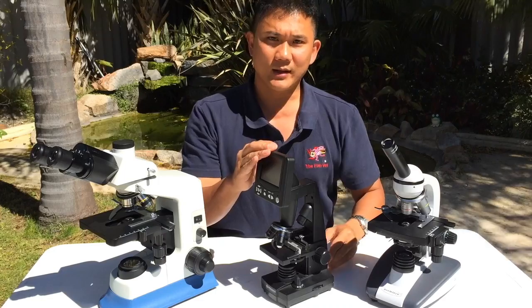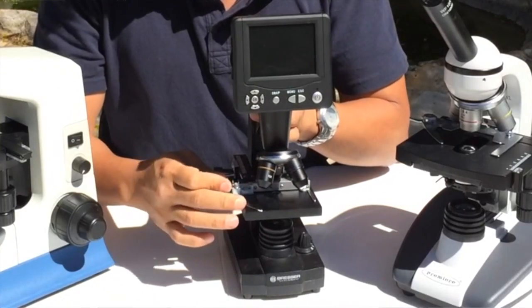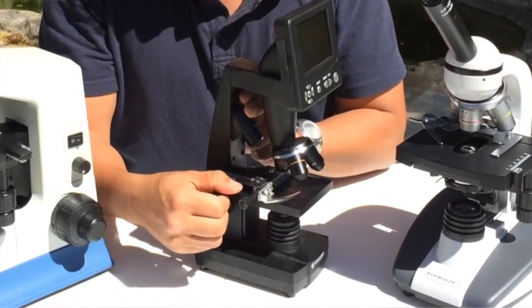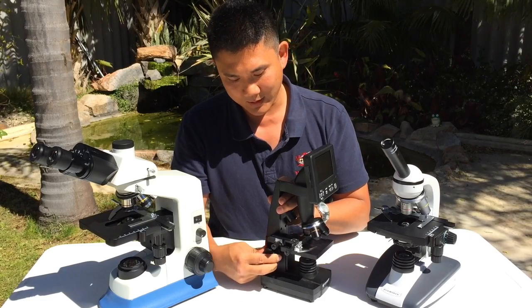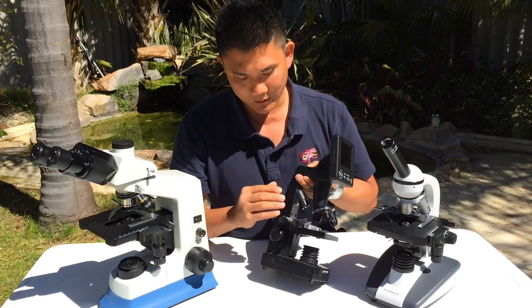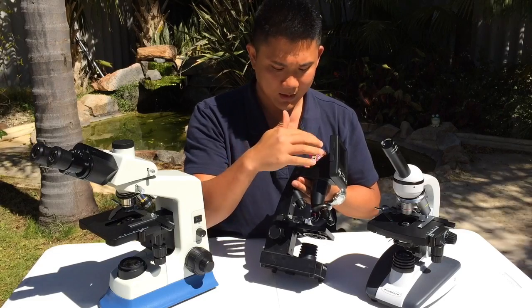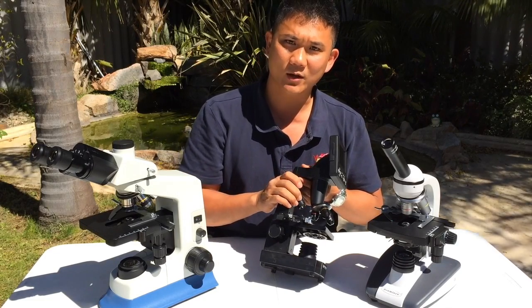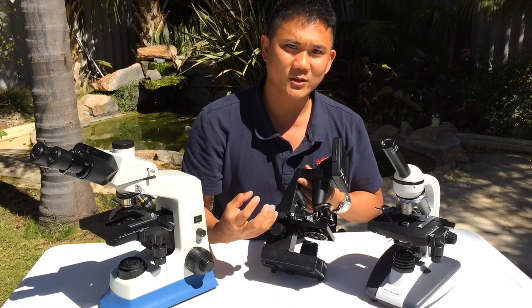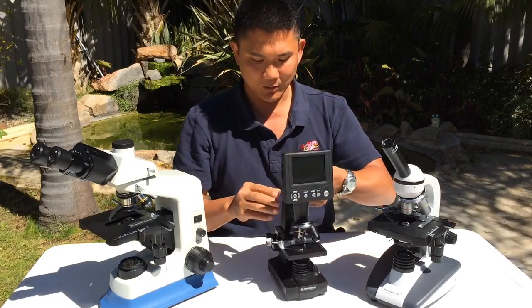To use this microscope you need a power supply. You put your slide onto the stage, use the clamp to hold it in place, and the stage control knobs move the slide left to right and forwards and backwards. There's a focus control to focus on the specimen. Most microscopes are illuminated from the bottom, but this microscope also has illumination from the top — useful if you're looking at feces or something thick that doesn't allow light to penetrate.